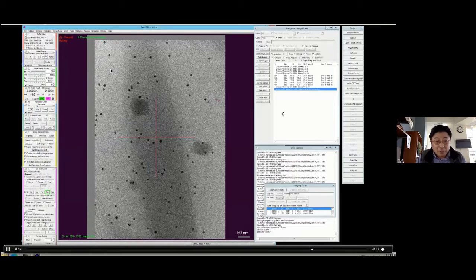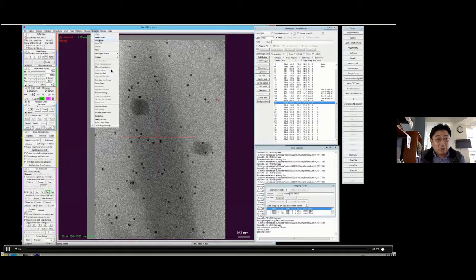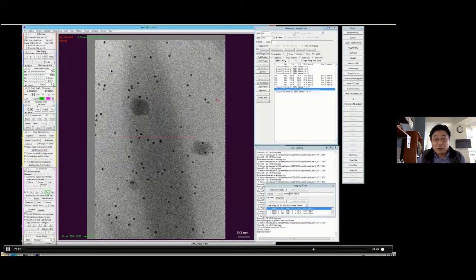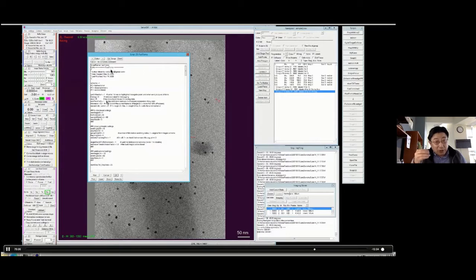Okay, see, now I finished. So then I merge. This is my current file. I have roughly 20 targets. Then I merge the file. This step is quite quick. So then I increase more, I just add more. Now I basically have more targets for collecting data. So I literally used less than 1 minute to interrupt the two series.